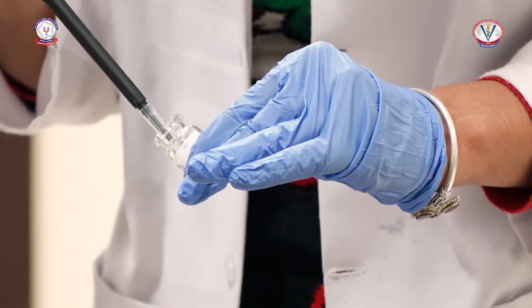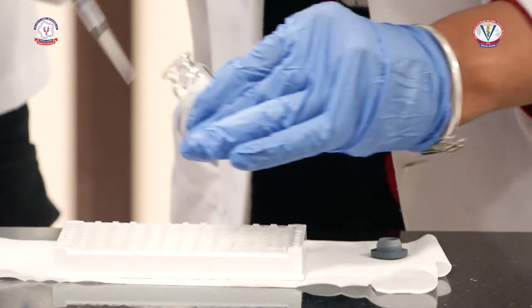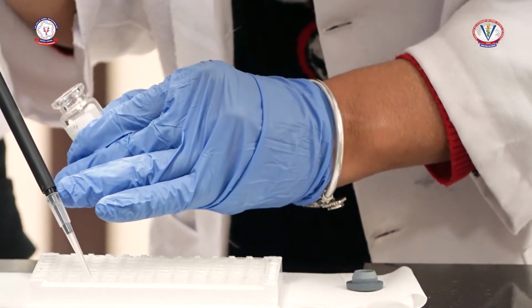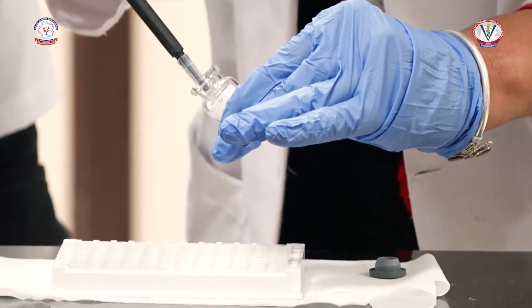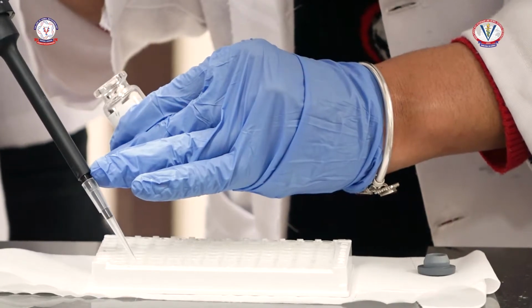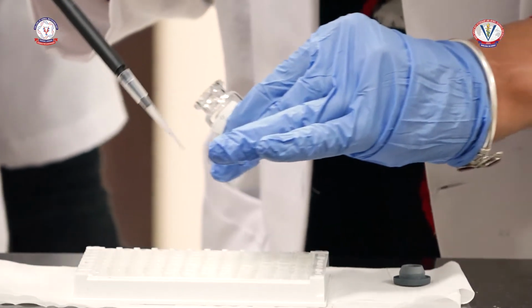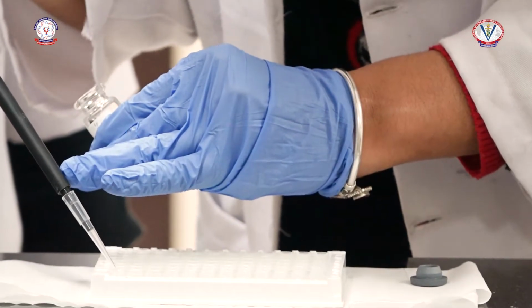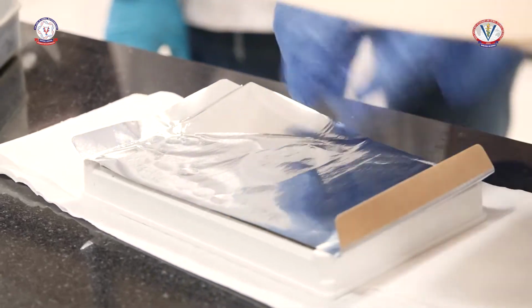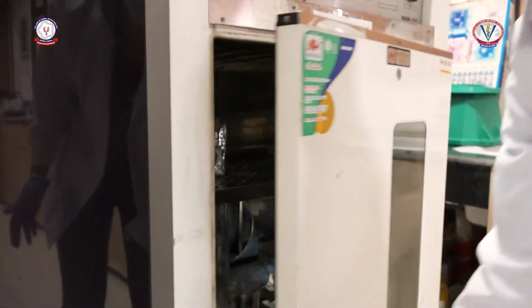After washing, sera and dilution buffer are added in each well. After the addition of dilution buffer, we re-incubate the plate for 1 hour at 37 degrees Celsius.